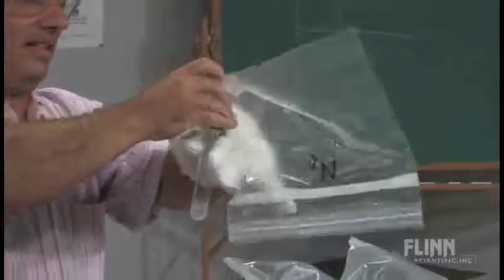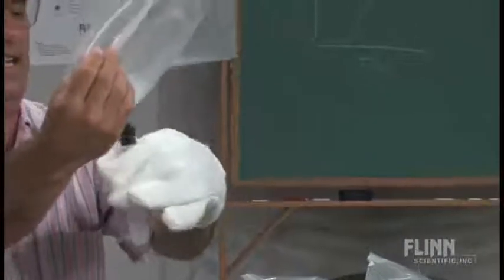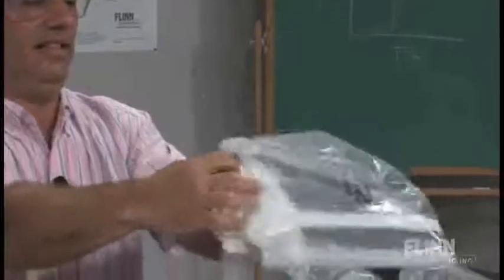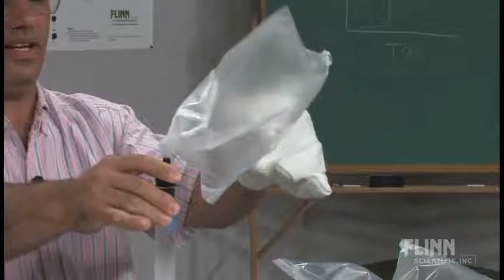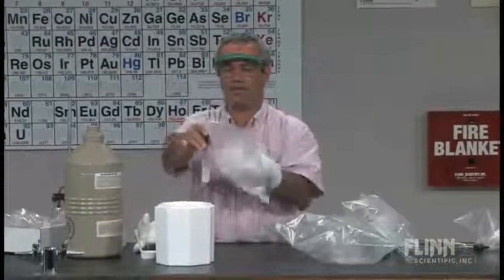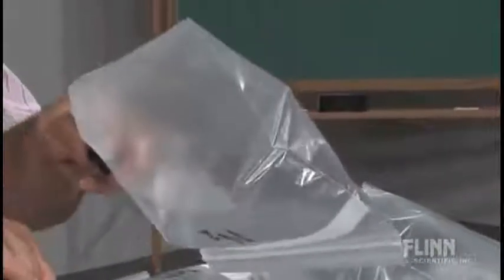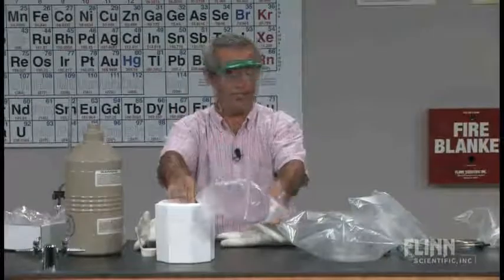So I'm going to hold onto that. And put... It doesn't take much. So we've got a liquid nitrogen there. And here's my bag. And fill that up. Now I can just kind of give that a little swirl. And that fills that up nicely. If I put too much in there, I can just pour the rest back in. The coldness is all down at the bottom. Up here at the top, I'm still fine. So there's my nitrogen. I did put more than I needed in. So I'm just going to pour the rest back there.